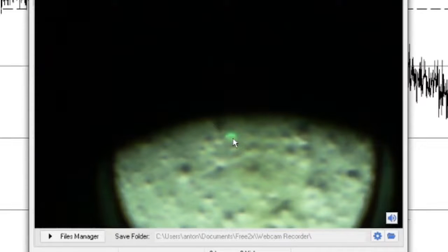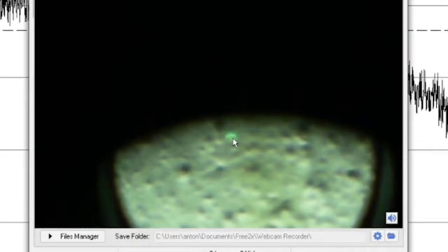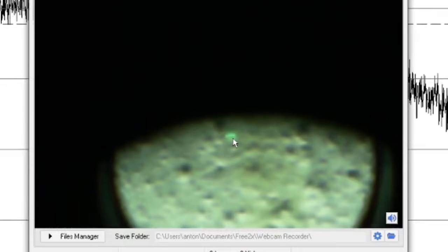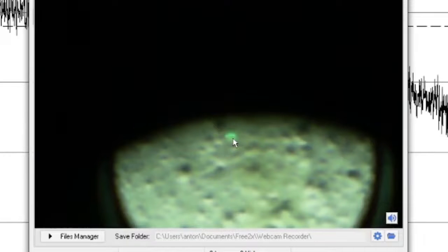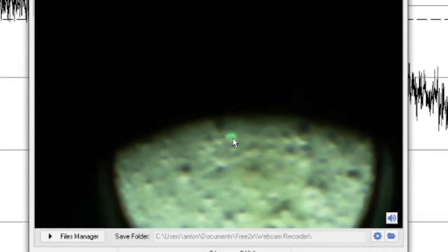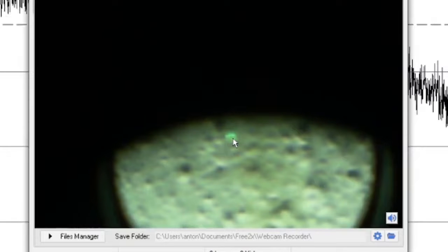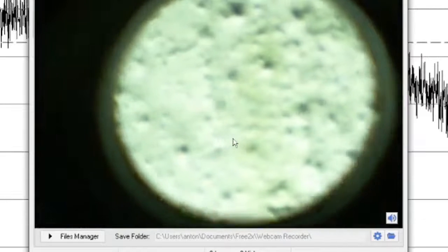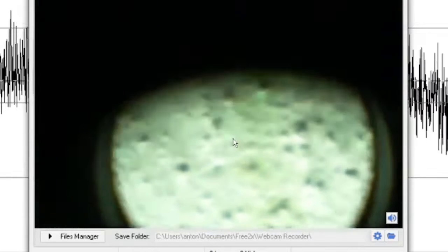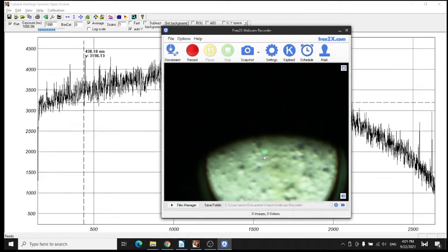This is important because from this area we can tell exactly where the laser is. When we have a small region, we can know exactly the dimension of the area. Remember, the circle that we see here is in the order of 4 or 5 millimeters in diameter. So the ability to check the actual position of the laser is very important, so we know exactly the spot.